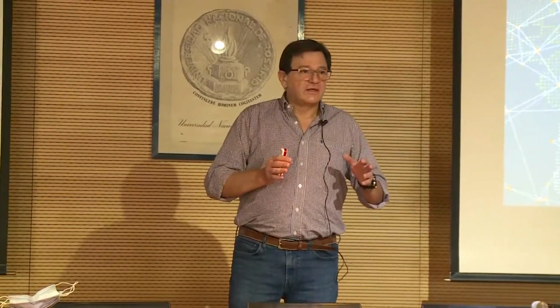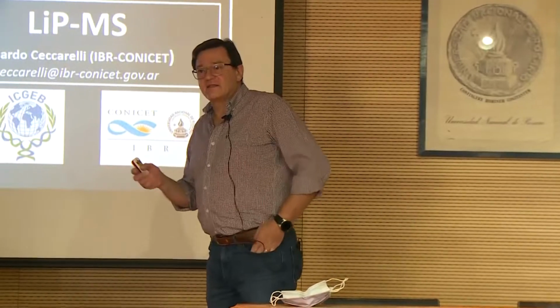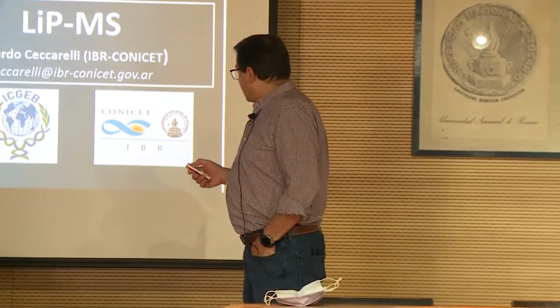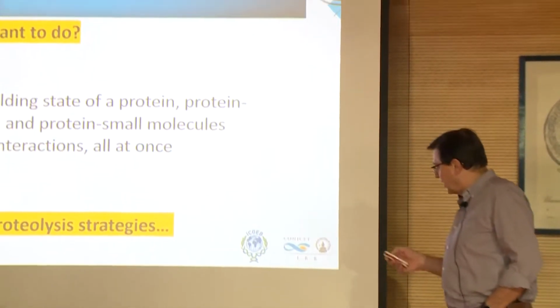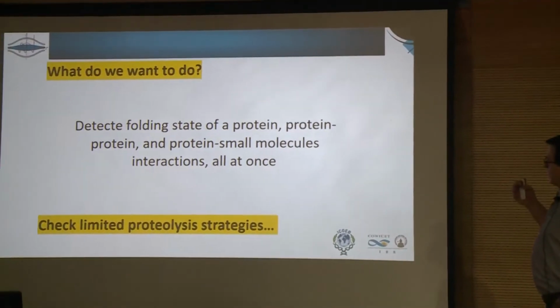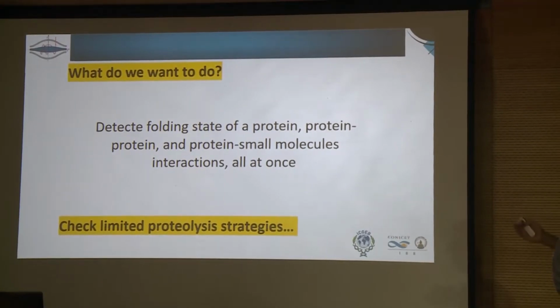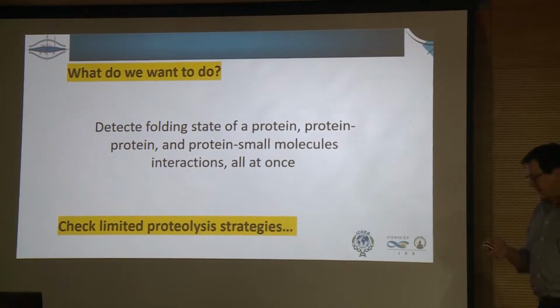It doesn't mean that this methodology tries to preclude other methodologies of proteomic analysis of interactions. So we will try to see how to detect folding, protein-protein interaction, protein small molecules interaction all at once.